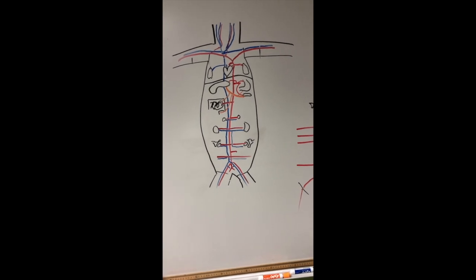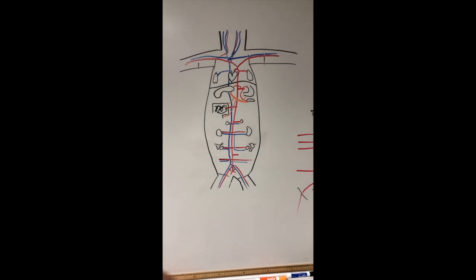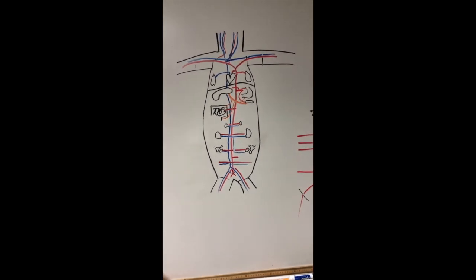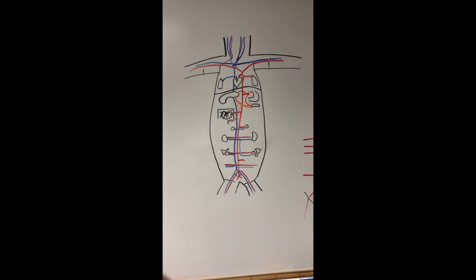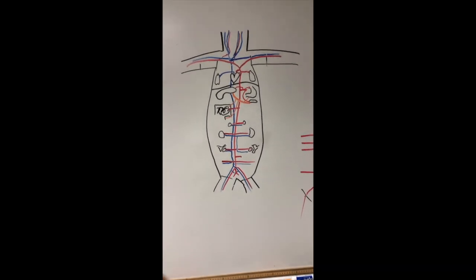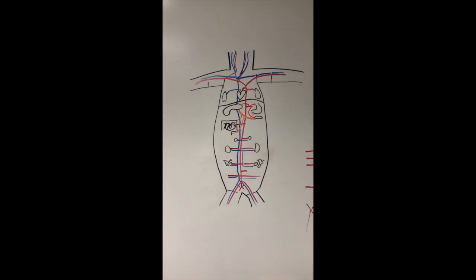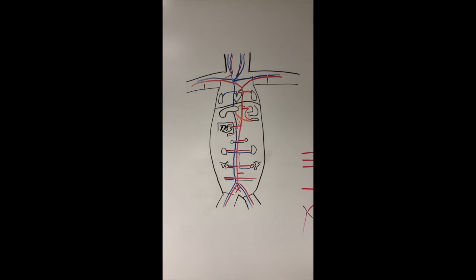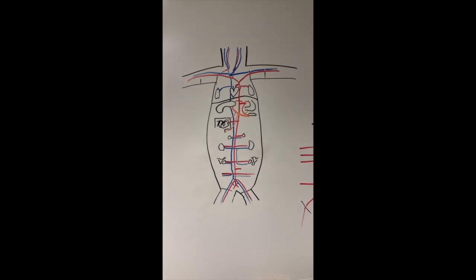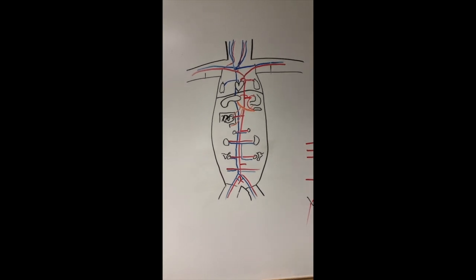And if you remember from last exam where the adrenals are in reference to the kidneys, not attached but up and center, you should be able to orient yourself that way. So I don't think I'm forgetting anything. So yeah, we'll jump into a quick demo of everything on the mink, and hopefully this is useful for you.